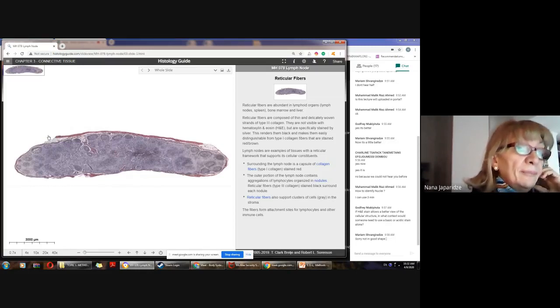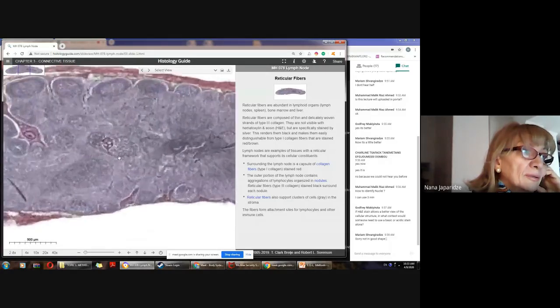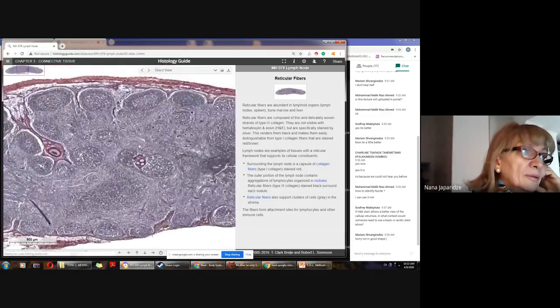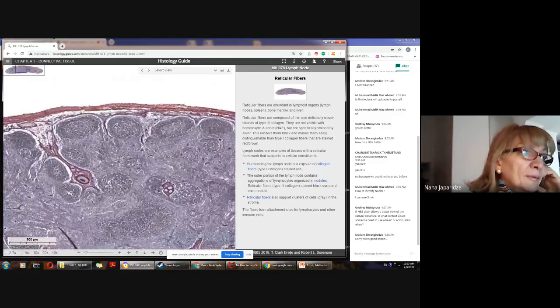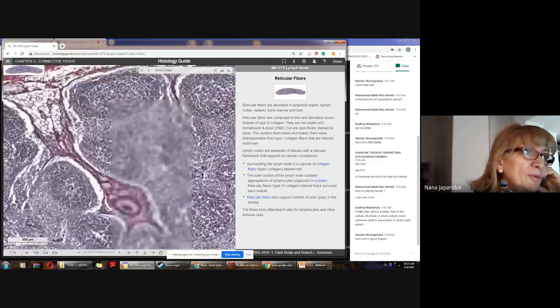And if we magnify this image, look, what do we see here, what is this? Blood vessel, of course, another group of blood vessels. What is this one? Look, do you remember this tissue?